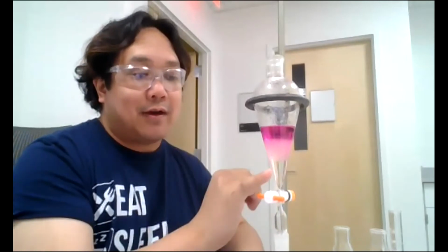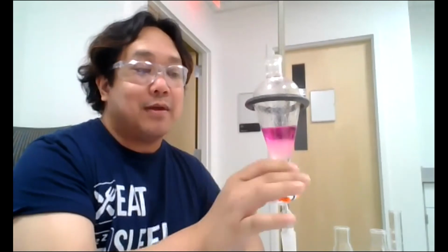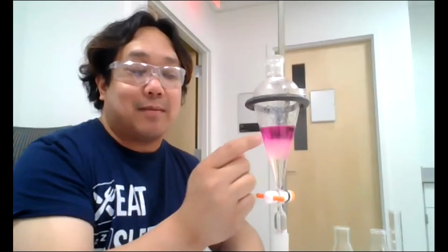Okay? Now, I think you can see it in the video that there's still a couple layers, but we have some bubbles here in the middle. But we definitely have a fairly colorless layer at the bottom, and now this layer at the top. Okay. Now it's time to pause your video and take more observation notes.